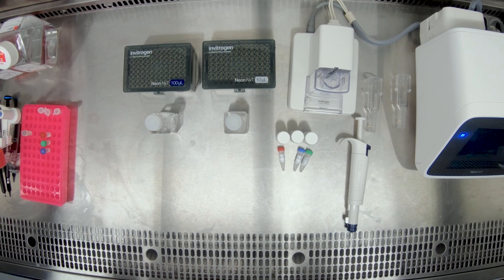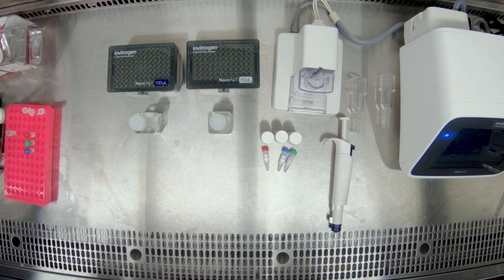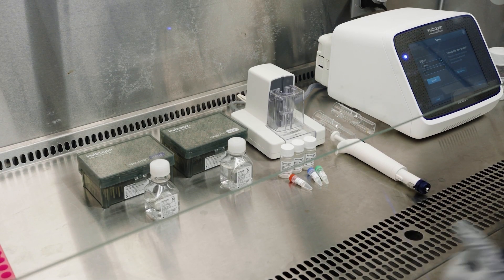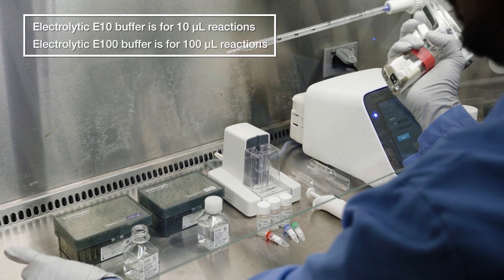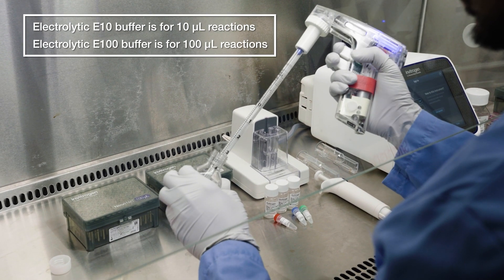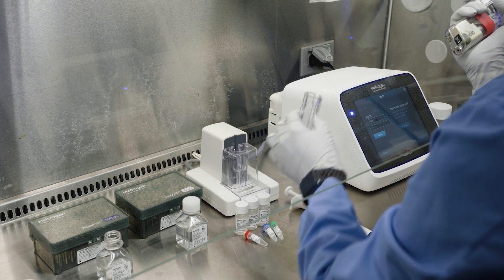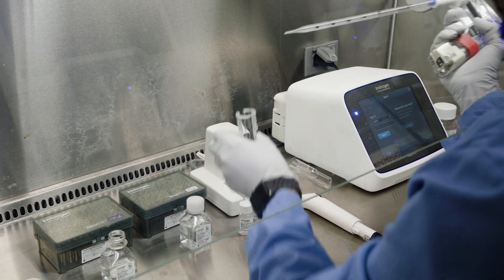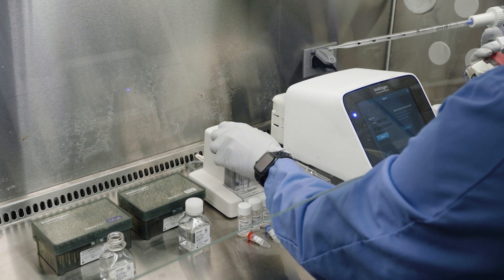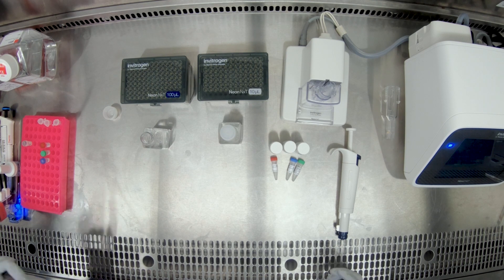The next step is to add the appropriate NeonNext Electrolytic Buffer. The NeonNext Electrolytic E10 Buffer is for 10 microliter reactions, while the E100 Buffer is for 100 microliter reactions. Add 2 milliliters of the electrolytic buffer to the buffer tube, and then dock the tube in the pipette station. The NeonNext Electrolytic Buffers help the system carry a charge so that the electroporation can occur.